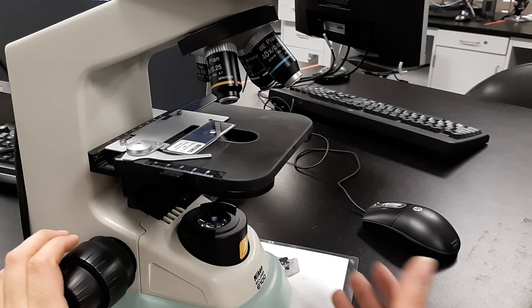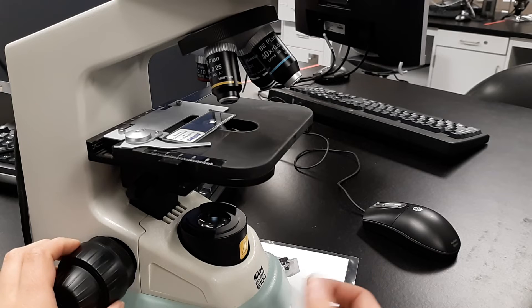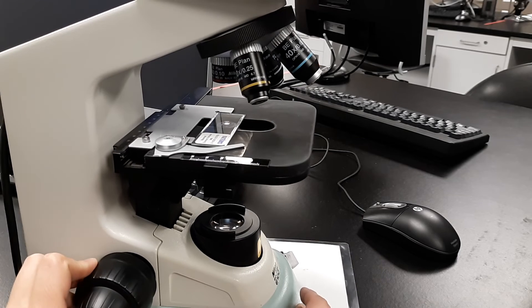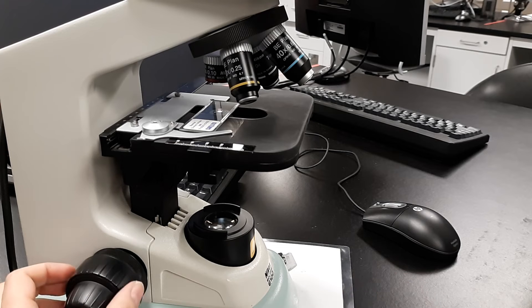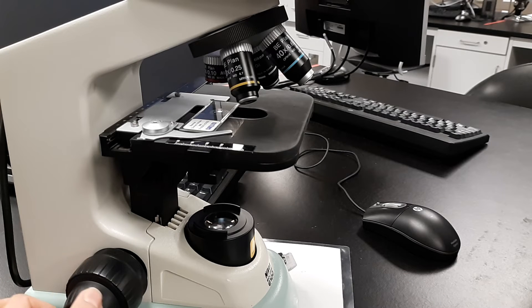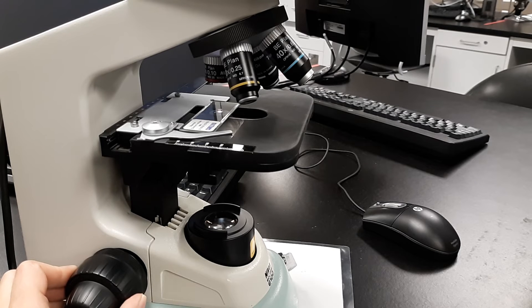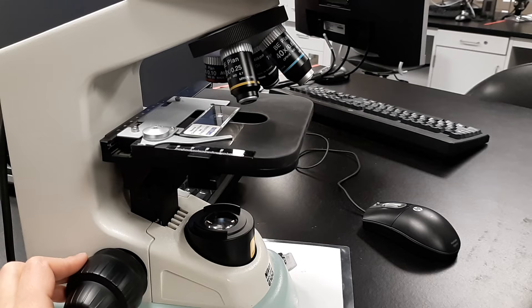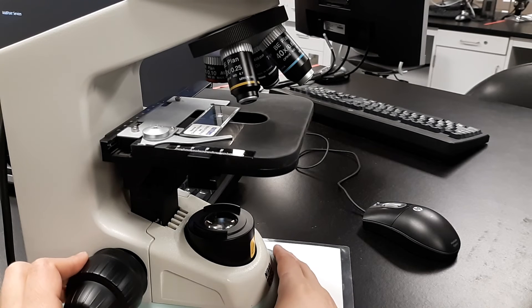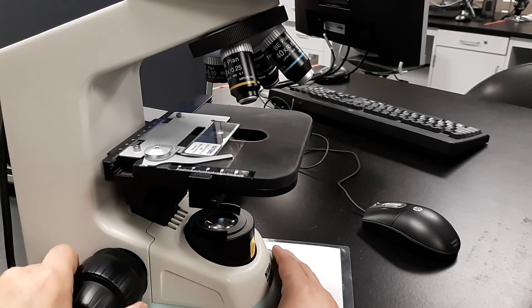There's a method called the top-bottom method. Start on the red objective and go all the way to the top. While looking in, start to focus down. This slowly brings the object into view. Make sure you're looking in so you don't miss it. There's another method where you start at the bottom and, while looking in, scroll up.